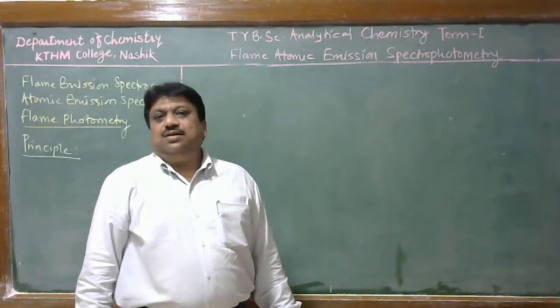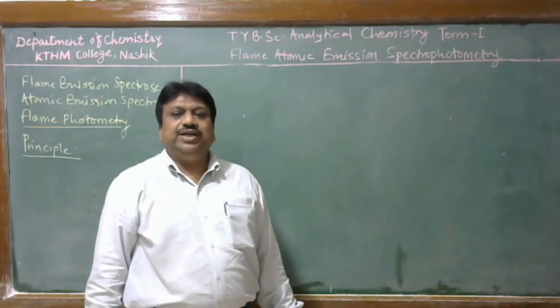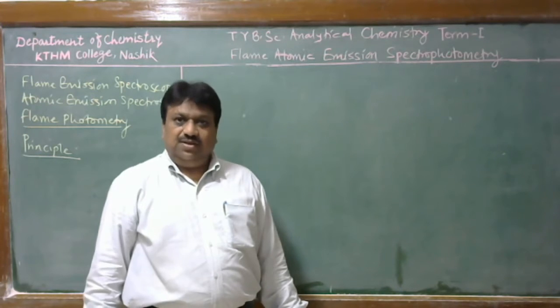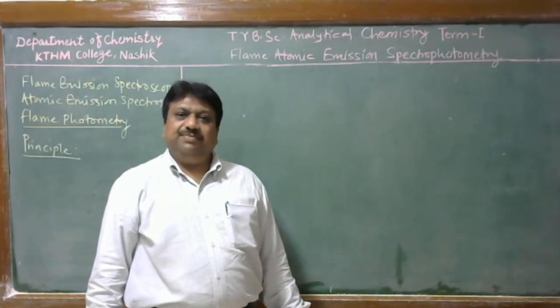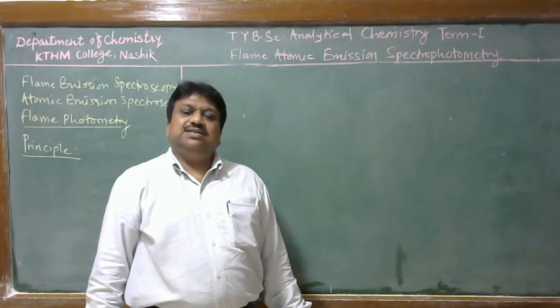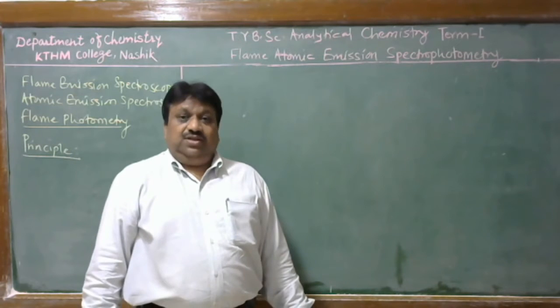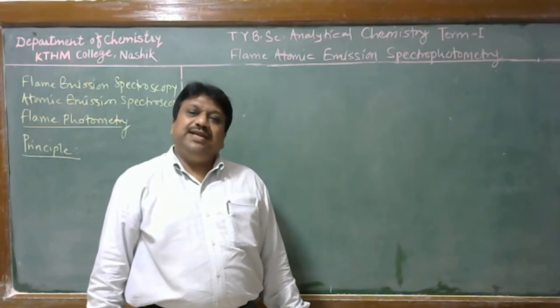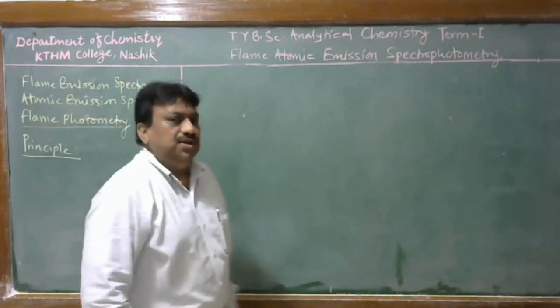Students, we know that flame atomic emission spectroscopy is limited to determination of alkali and alkaline earth metals. These metals are easily atomized by using a flame temperature, as well as these atoms are excited by using thermal energy. Therefore, here the flame emission spectroscopy is limited to determination of alkali and alkaline earth metals.